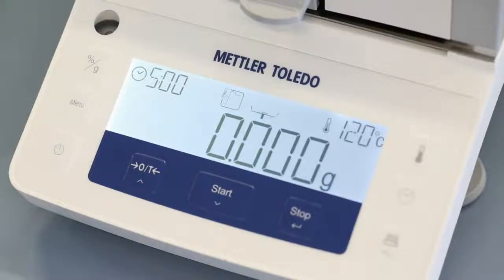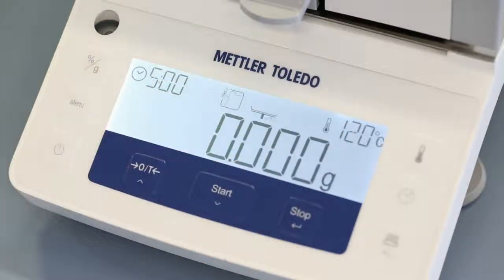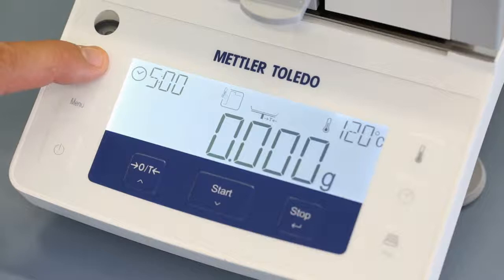The display shows all of these selected parameters: drying temperature of 120 degrees, drying time of five minutes, and in this case, rapid drying program.